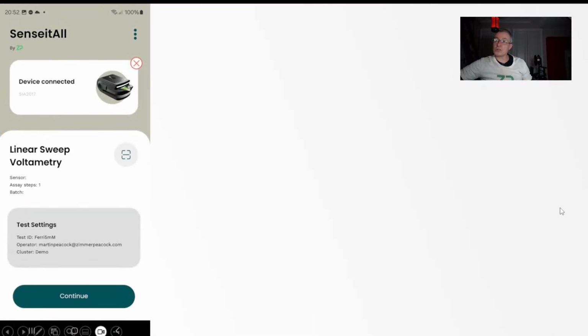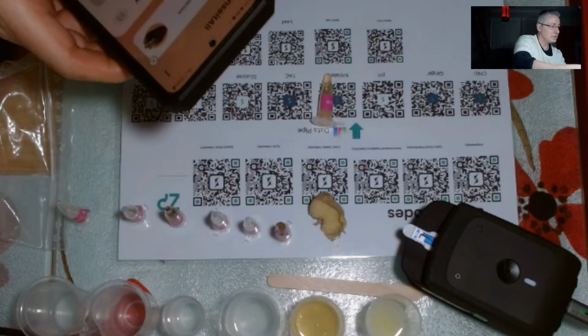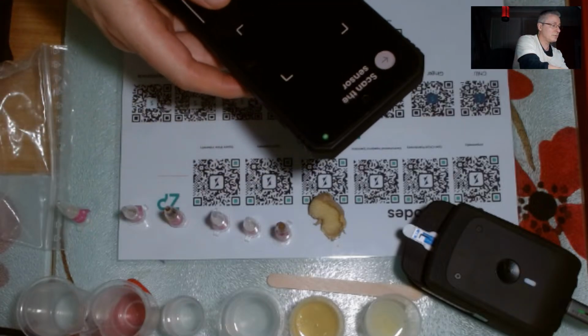And what you're doing wrong here is, if I wanted to get the result in this kind of work quicker, first of all, I could halve the time by doing linear sweep voltammetry. So rather than cycling there and back, I could just do linear sweep voltammetry. Super easy to do on the instrument. Let me just try and find linear sweep.